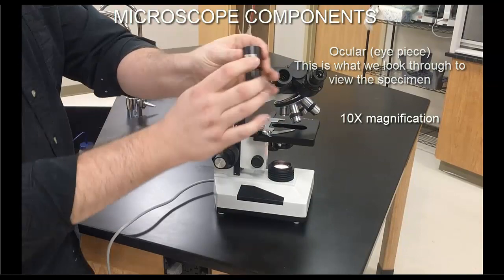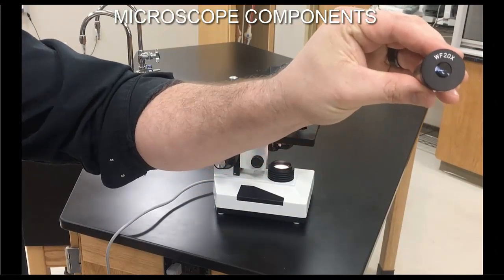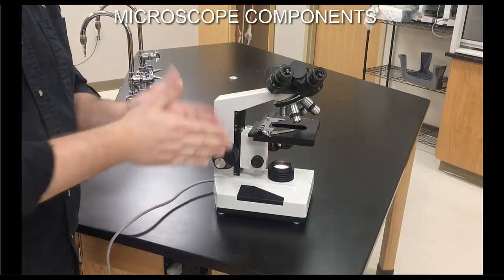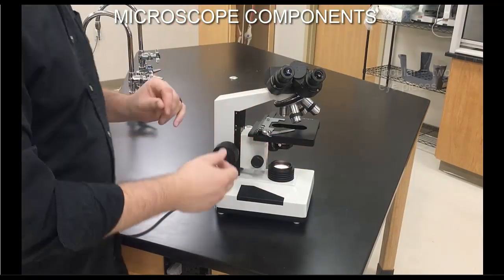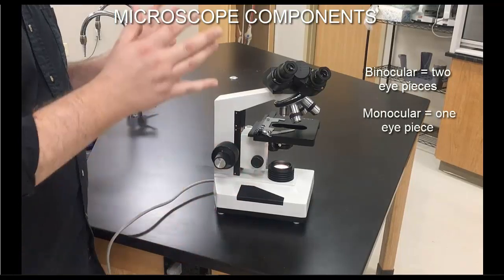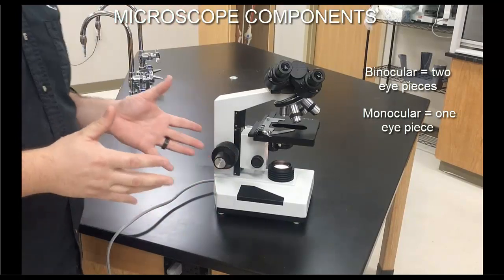When using a standard ocular, it magnifies by a factor of 10x. Some oculars can have higher magnification, such as 20x, 25x, or 15x, but 10x is what you'll typically see. Many of the microscopes in our facility are binocular, meaning they have two eyepieces. Some are monocular with only one eyepiece. The difference with binocular is that we can adjust them to fit the contour of our face for less eye strain over time. For shorter sessions of 30-45 minutes, you can simply close one eye and look through one eyepiece.